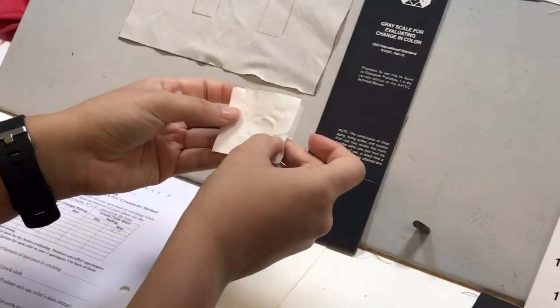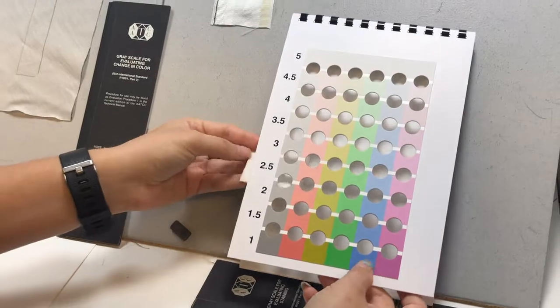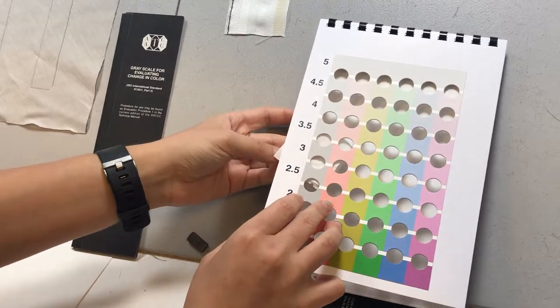Step 8. Rate both crock cloths with the chromatic transference scale. Back each crock cloth with three layers of fabric. Record all your data and repeat with the other specimen.